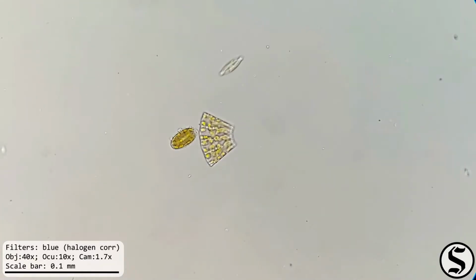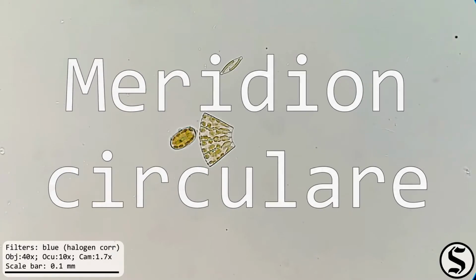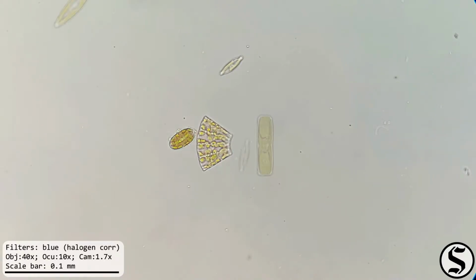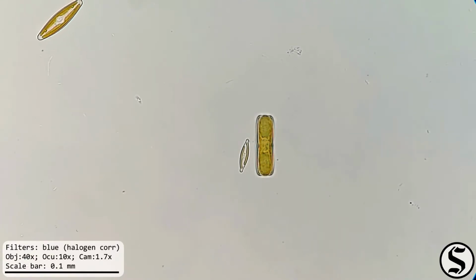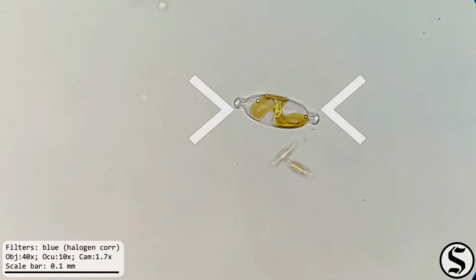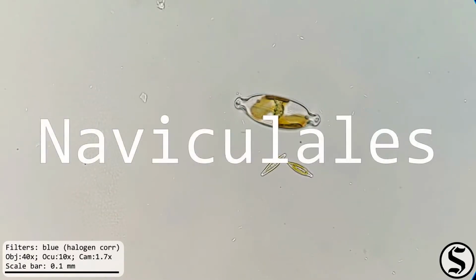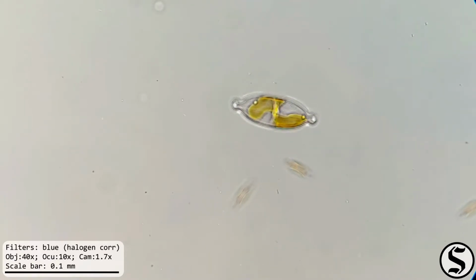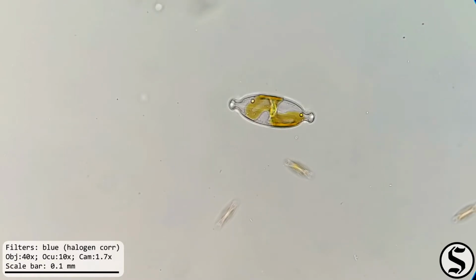Oh, this interesting multi-part semicircular one is Meridion circulare. The genus Meridion comes from the Greek meris, a part or a portion, and the species circulare from the Greek kirkos, circle or ring, which is the same root as circus. And this one here is of the order Naviculales. That's from the Latin navicula, small ship, from navis, ship.